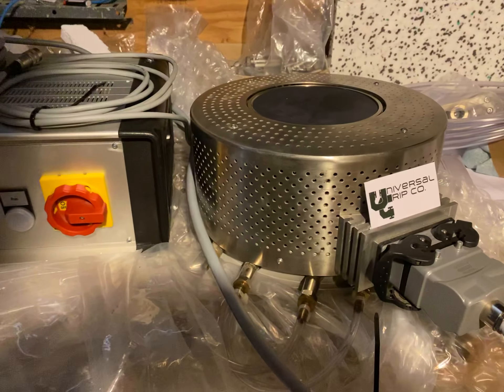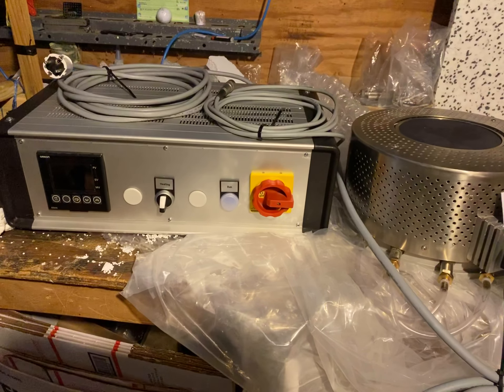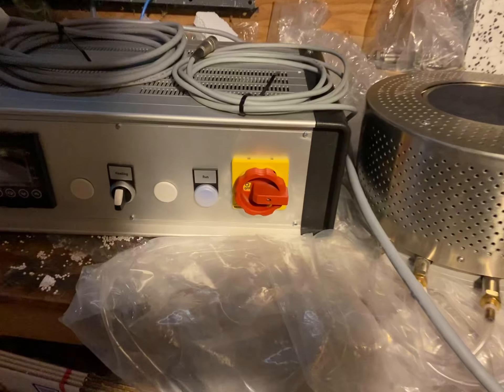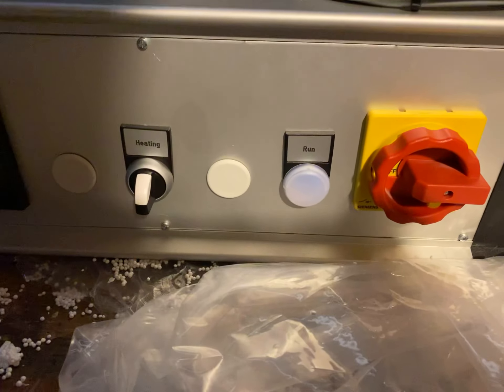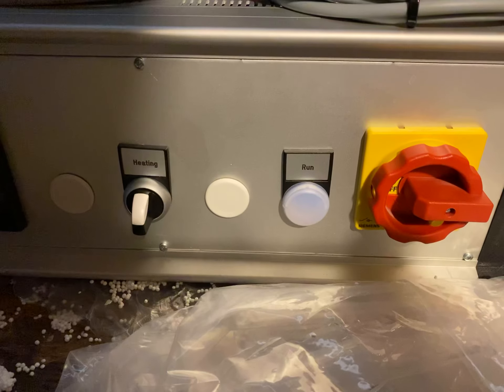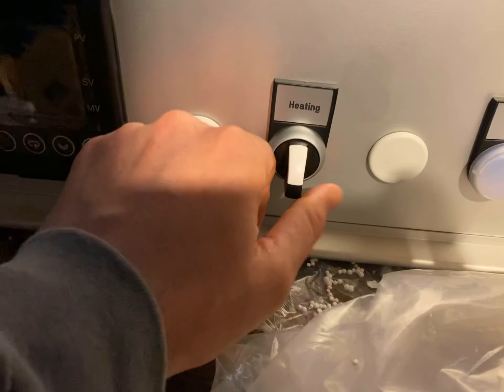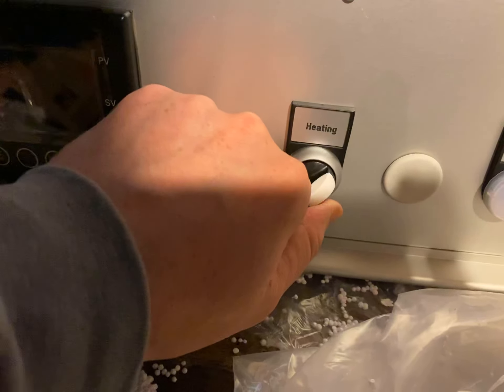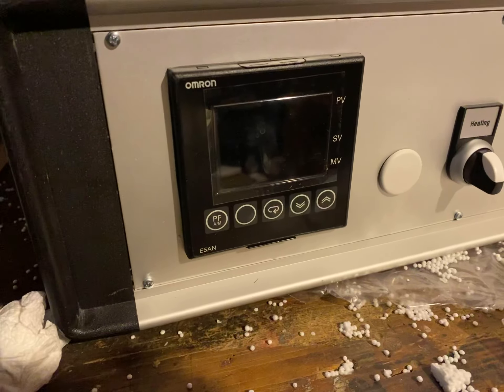The platen is connected to the control box here — this is how you manage all the settings and the temperature. You can see we have an e-stop there and a light that will be green when it's running. To turn it on, you simply click the switch here to activate heating, and then once it's on you control the actual temperature here.